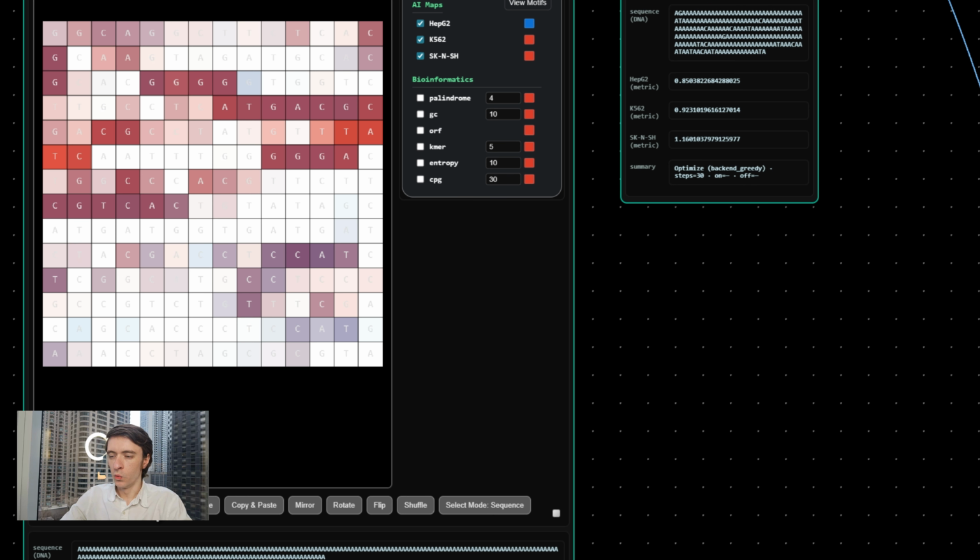At a time, you could change this. If you really want to be drastic, you change it to 4 and so forth. We'll stick with 3 here. That's a good starting point.